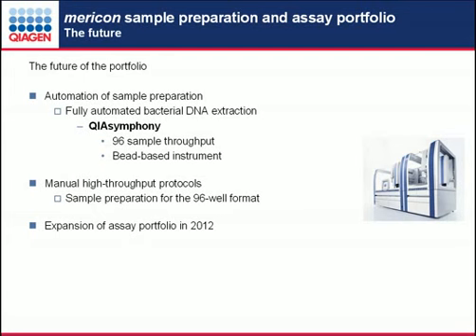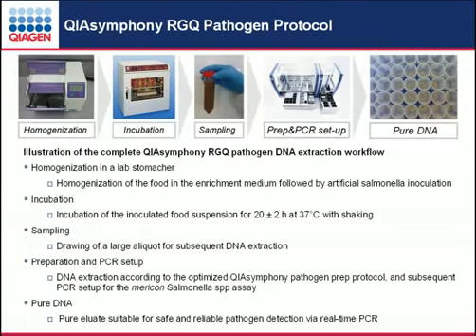Ultimately, some manual high-throughput protocols that would allow you to do 96 wells of the short manual protocols, and some expansion of the assay portfolio in 2012.